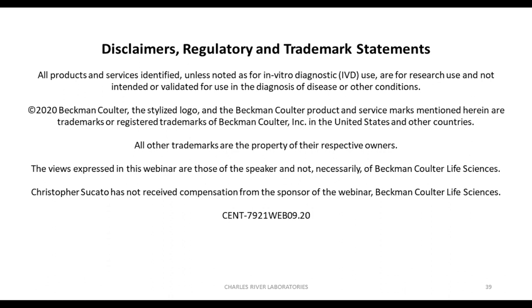So sedimentation coefficient is very much a mass-based, very much correlated with the mass of the species, but there's also some shape information which may be embedded within the AUC data. So a fitting algorithm that can make simultaneous sedimentation coefficient and frictional ratio or diffusion coefficient information available from a single fit would be an excellent attribute, I think.